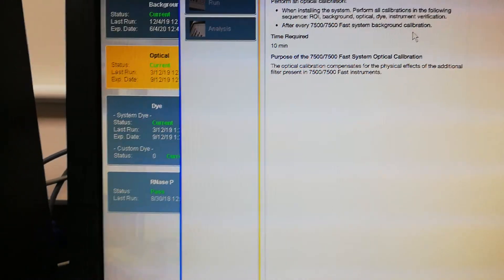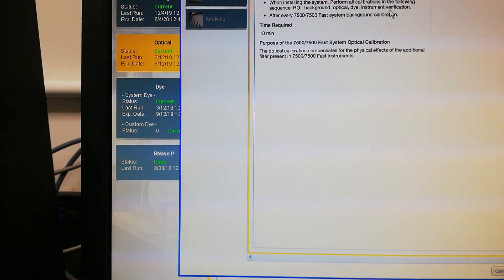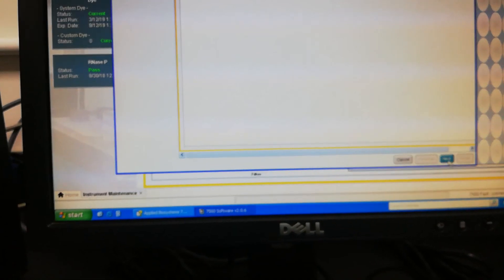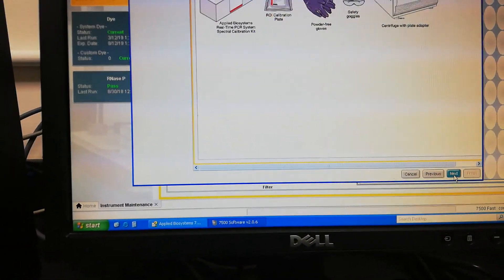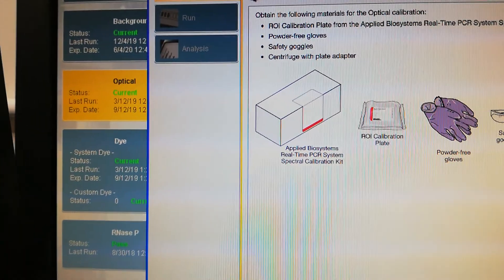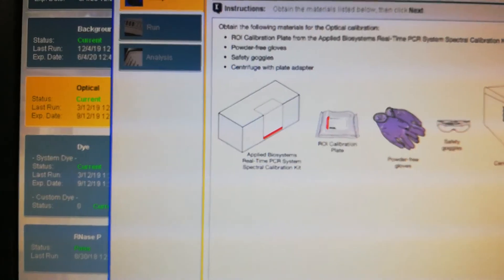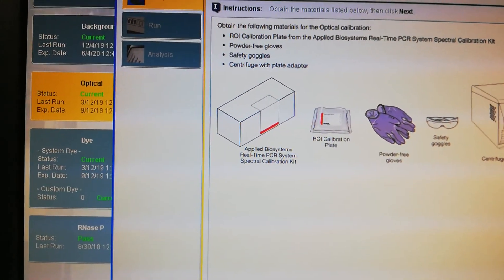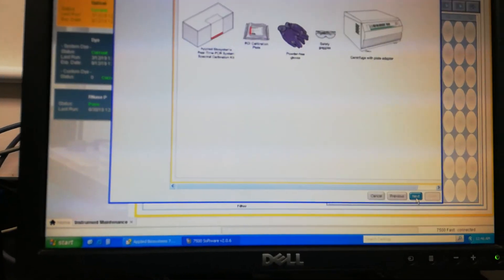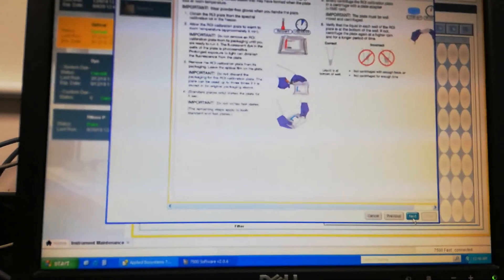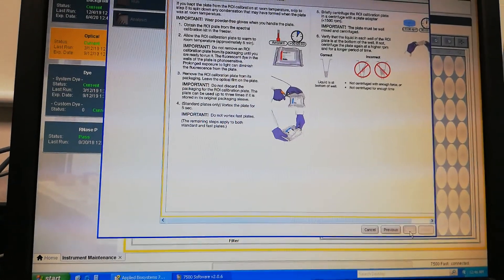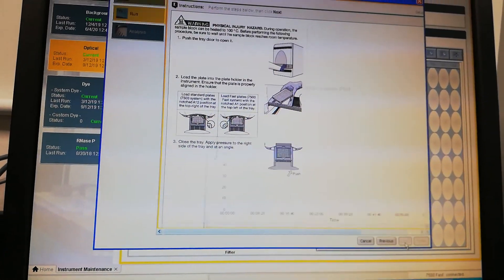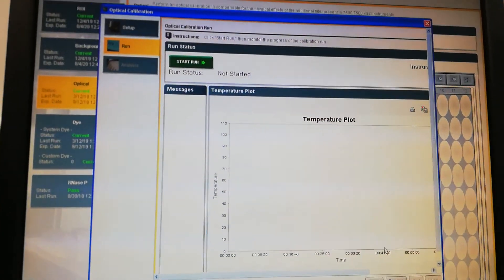I am calling ROI background optical dye instrument verification. Select next. Again, I am trying to use the ROI calibration plate here. Next, next, next, and then next. From here we just start that up.